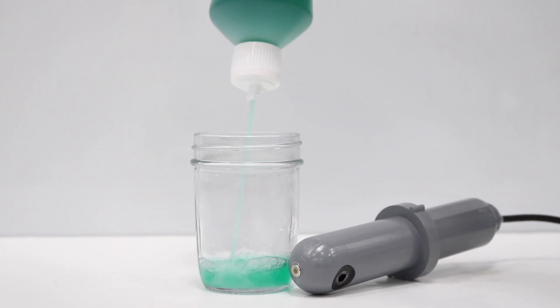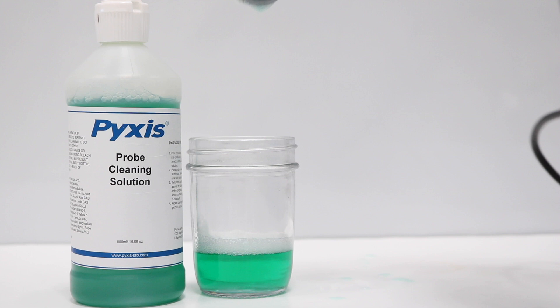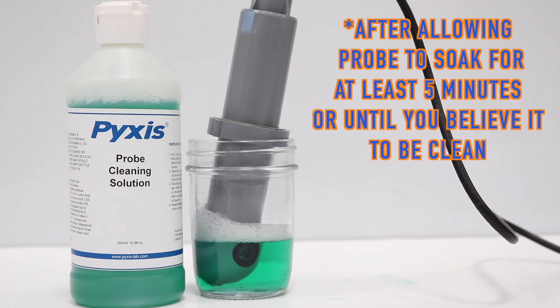To begin the cleaning process, pour Pixis Probe Cleaning Solution into the jar. Then place the probe into the solution, allowing it to soak for at least 5 minutes. After letting it soak, gently scrub the probe with a pipe cleaner and a q-tip.